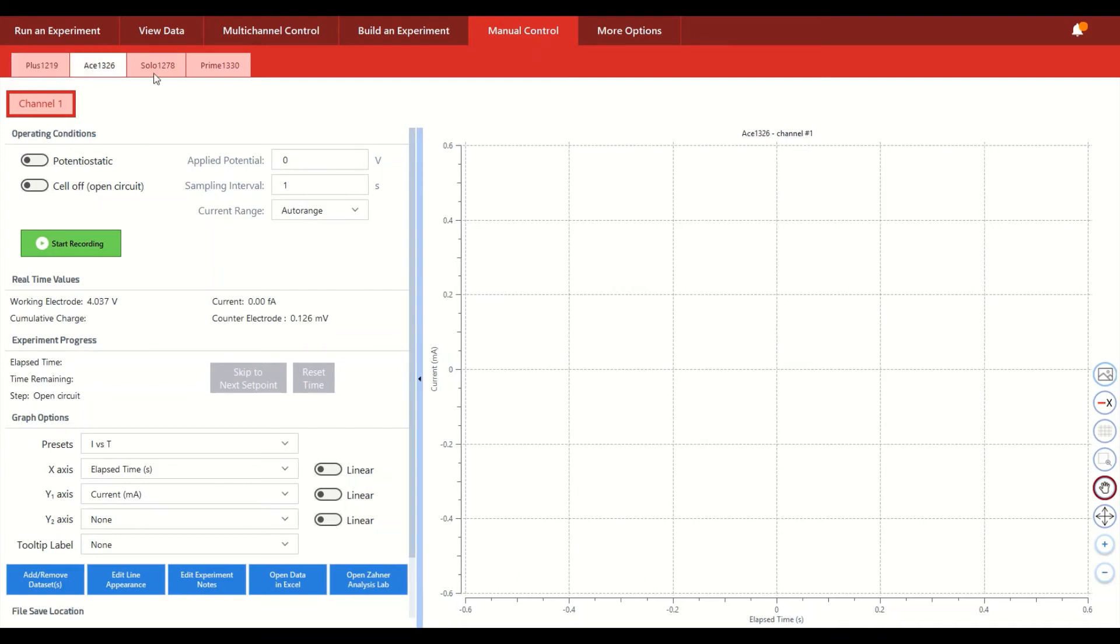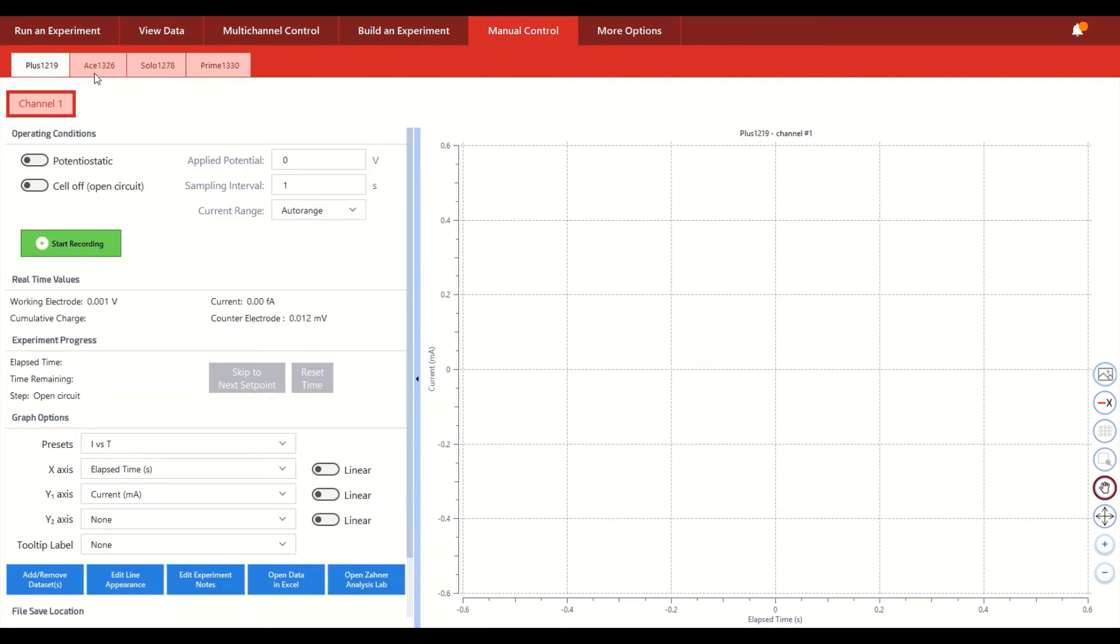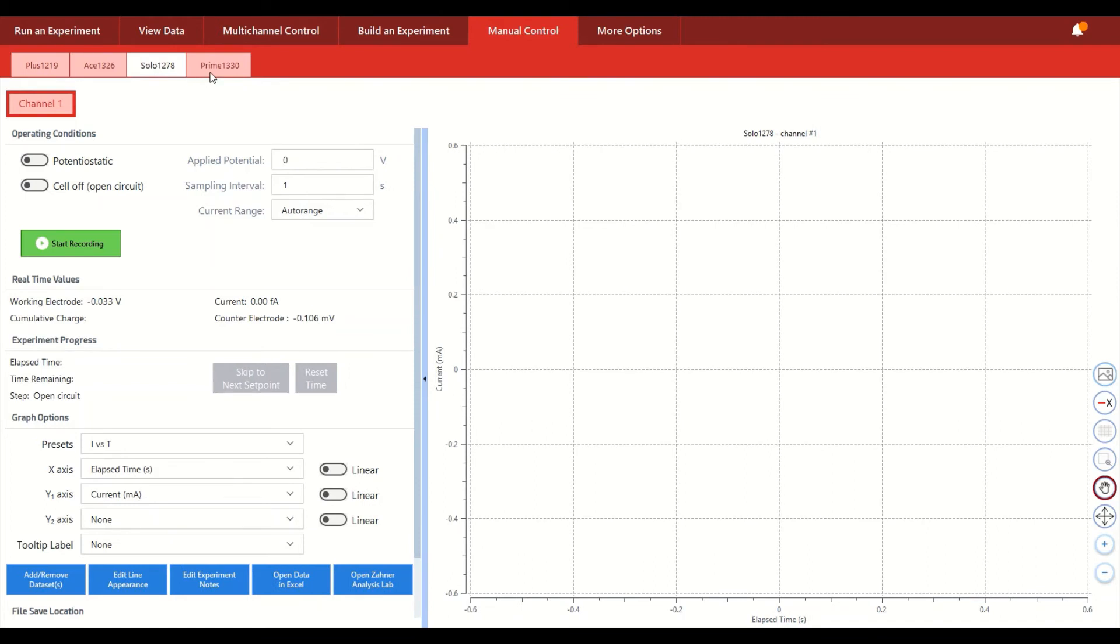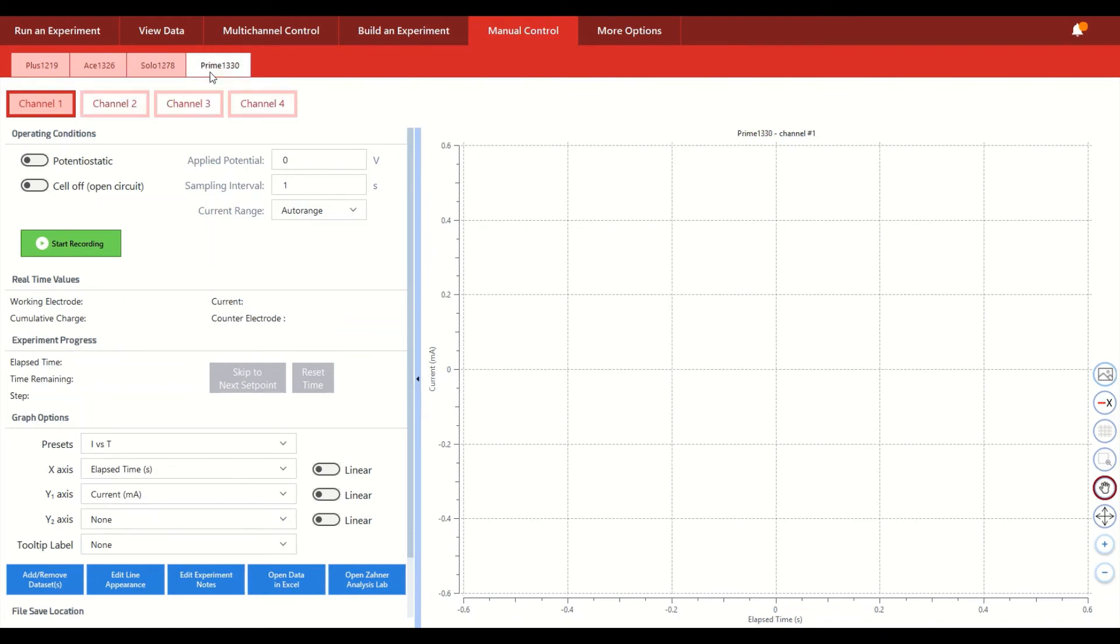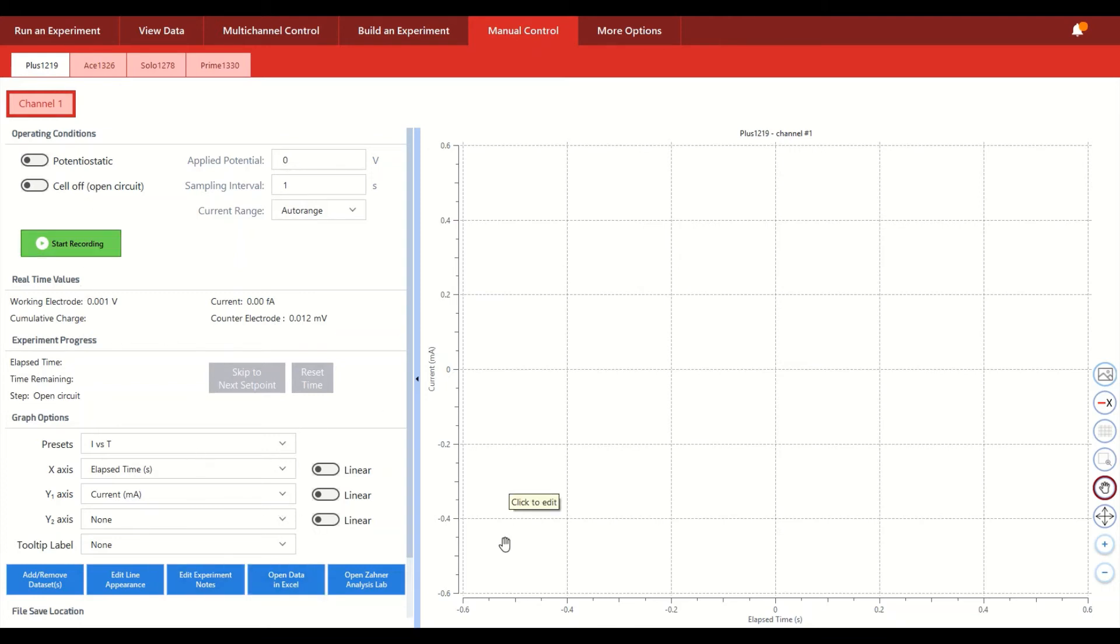So this is a cockpit sort of view of each one of the different squidstats that are connected to the computer. So in the case of the squidstat plus that I'll work with to showcase this mode, you can see here that we have all the different sort of operating conditions and real time values and graph options that are available to us.